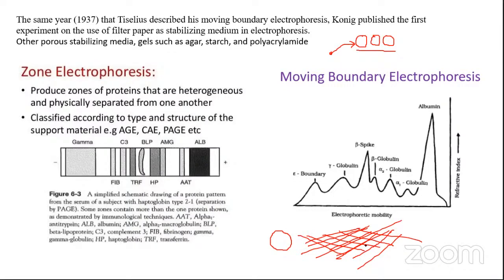So if the concentration of the gelling component is low, like for example agar, because you have dealt with agar previously, if I use a low concentration of agar, then it will be more jelly-like. While if I use a high concentration of agar, it will be more solid, right? That is because there is a more intense meshwork there. So the pore size is the deciding factor.